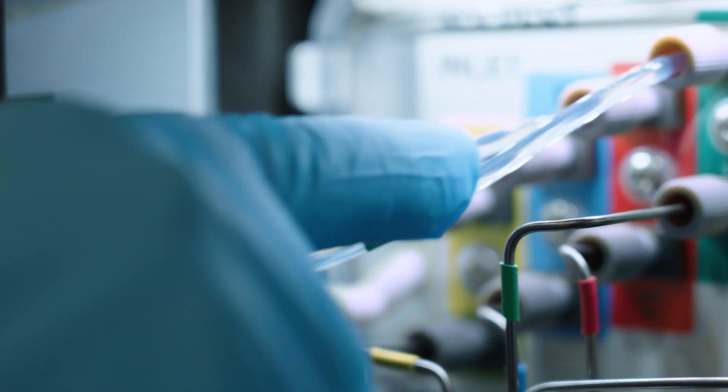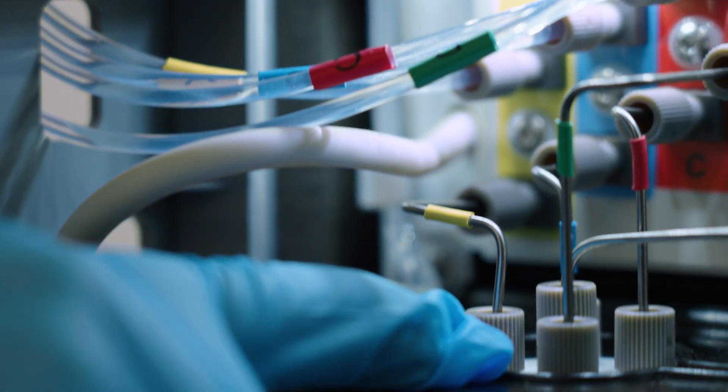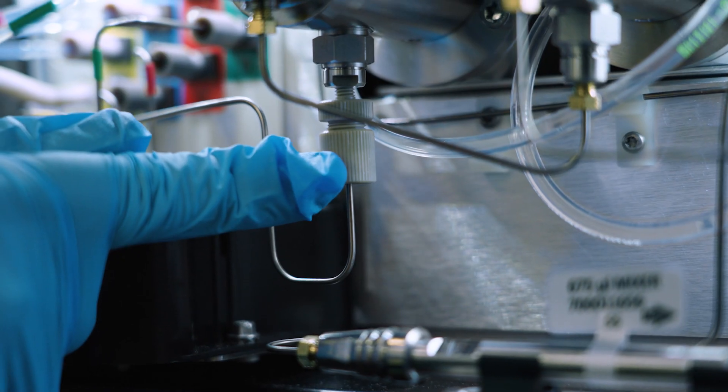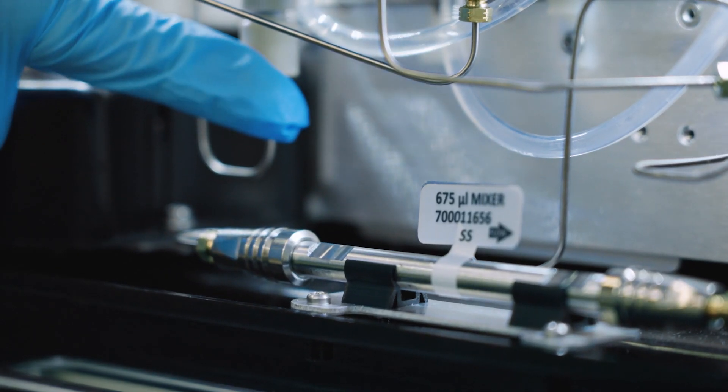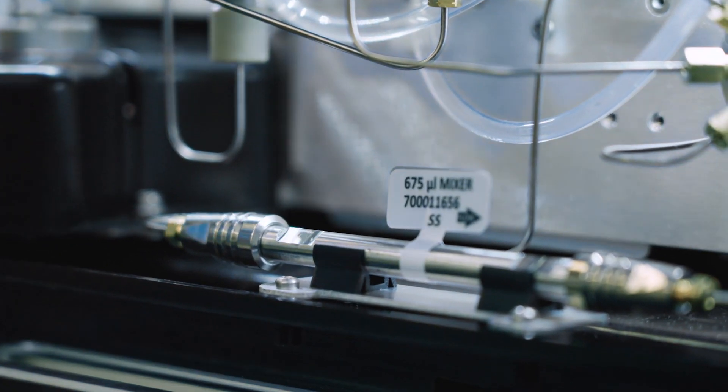All serviceable parts are easy to access. The solvent flow is through the gasser and into the gradient proportioning valve, through the check valve and into the pump heads. To prime, the vent valve sends the solvent to waste. When the system is pumping, the vent valve switches the flow through the mixer.